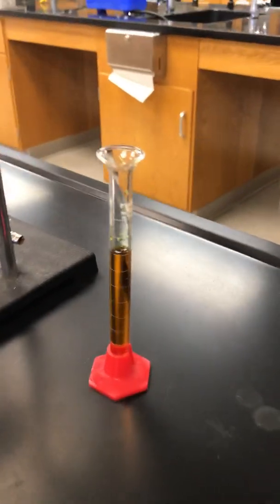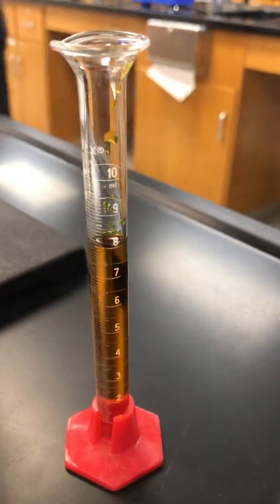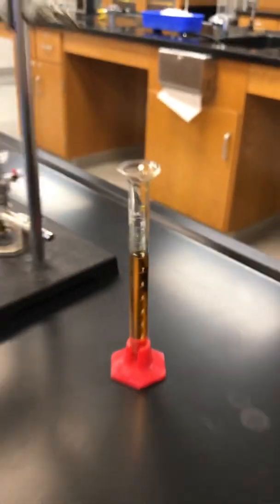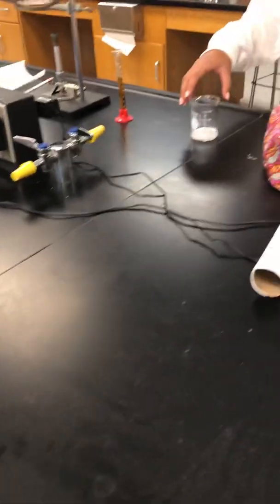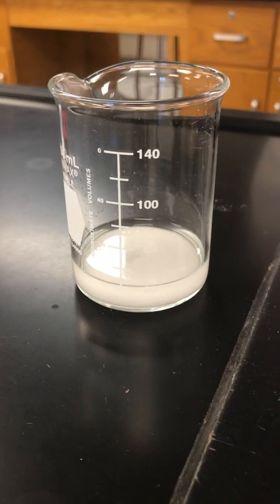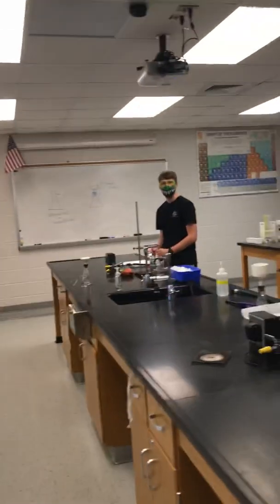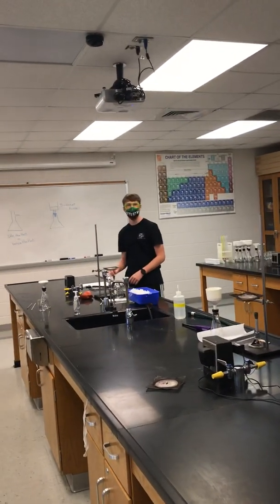Then we got 8 milliliters of the iron chloride, and 20 milliliters, and added water to get to the 20 milliliter mark. But it's not going to dissolve, so we have to heat it up. We're going to use the ice cold water at the end.